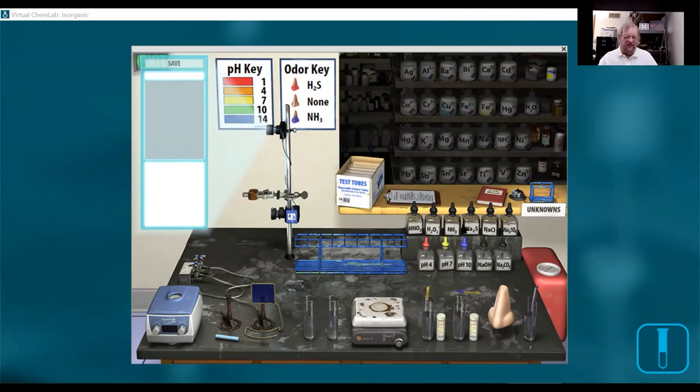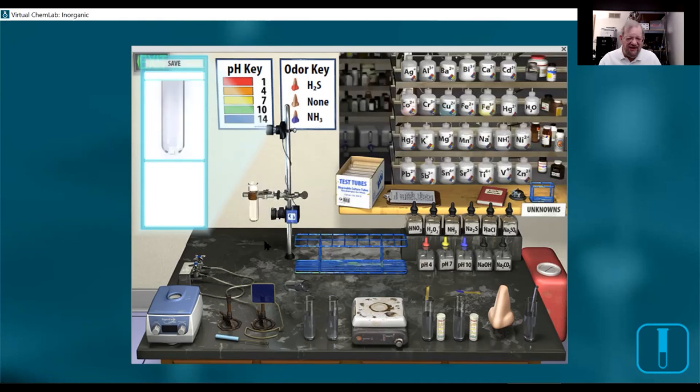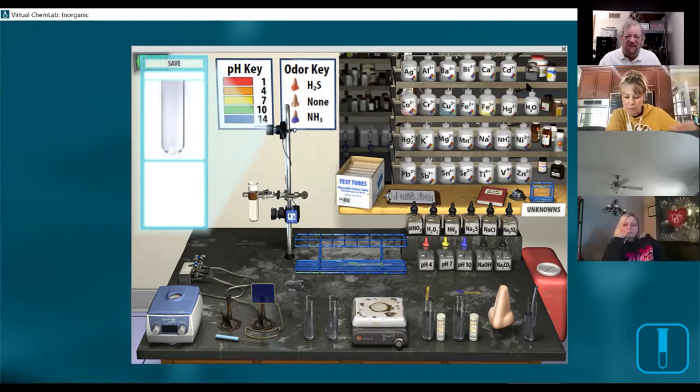Now, watch closely. This is really a lot of fun. They did a good job. This box actually looks like the box test tubes come in when you buy it, at least at COD and ECC. Take your cursor, click on this, left mouse click, and put it in there. When you do, this is what the test tube looks like. Notice how this all lit up. And now you can choose from that.